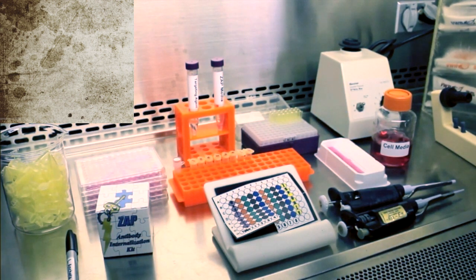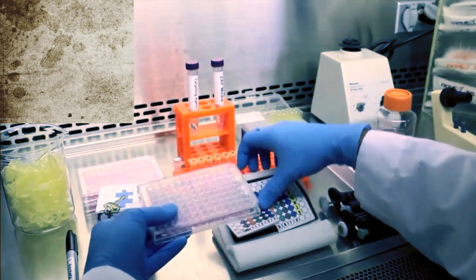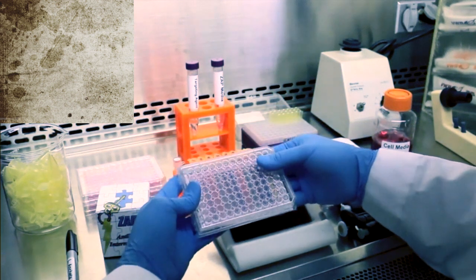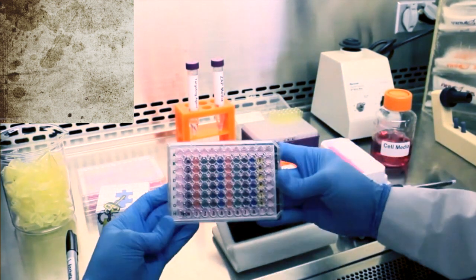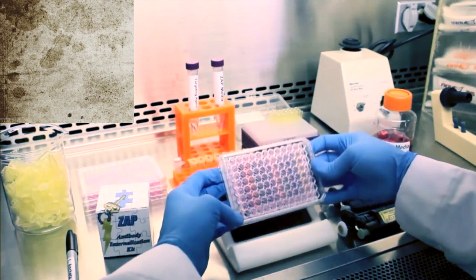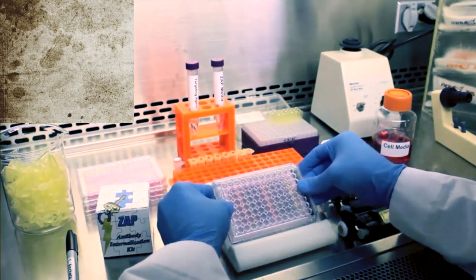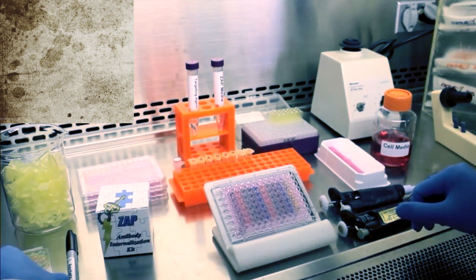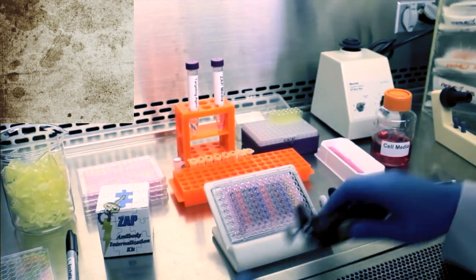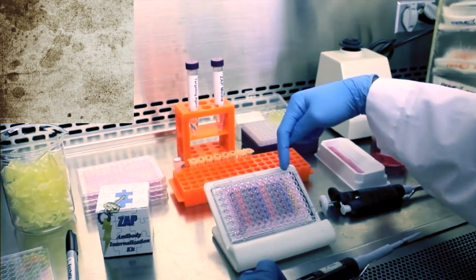Now you're ready to add material to the plates. Begin by placing the well template underneath your plate. This will help you keep track of where you are adding the material. First, you'll add material to the control columns. Column 2 will contain cell media only, and column 11 will contain ZAP media.